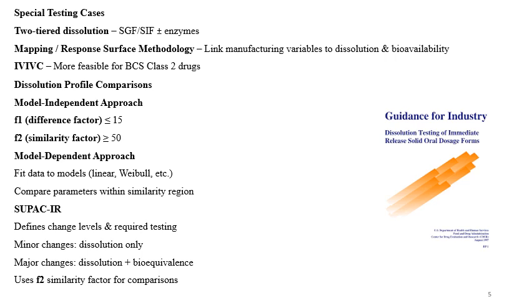Then SUPAC IR defines the change levels and required testing. So there are minor changes and major changes. I request you to go through the SUPAC guidelines to understand this topic in detail. I have made some videos on this topic. You can search in the channel playlist and go through those videos. In SUPAC IR, for minor changes, dissolution testing is required.